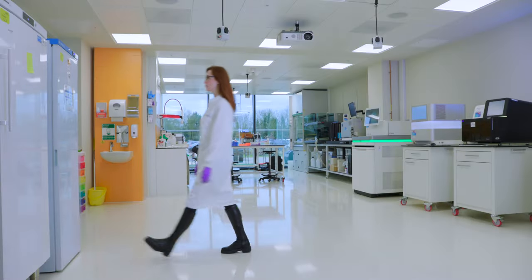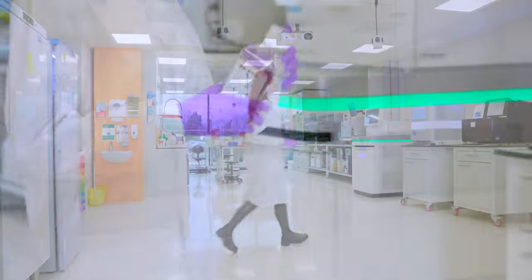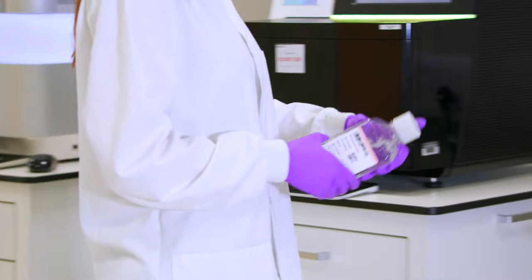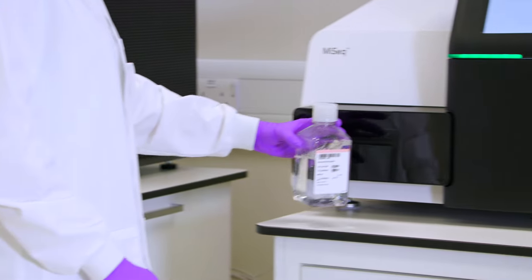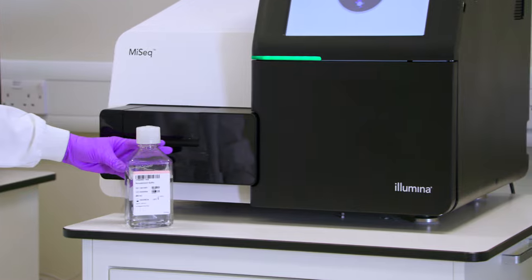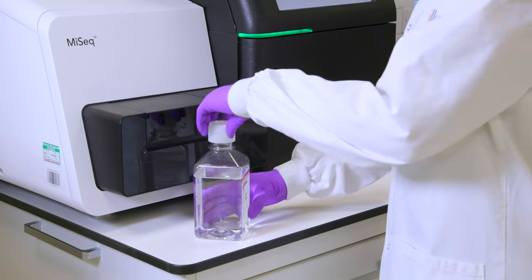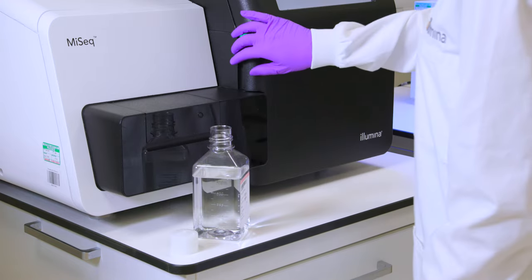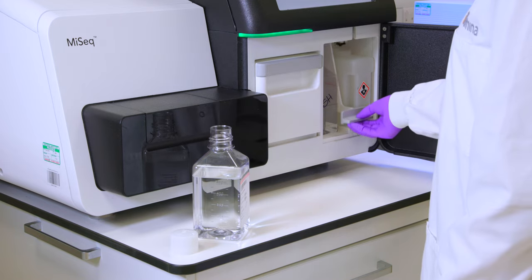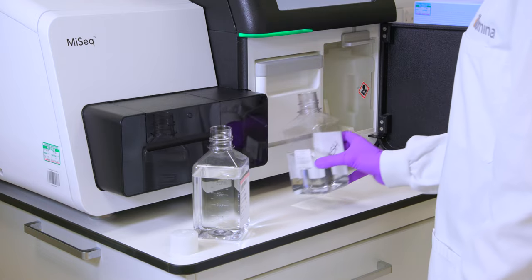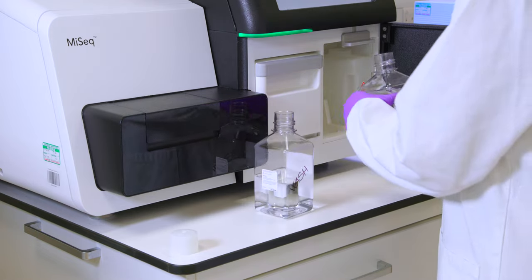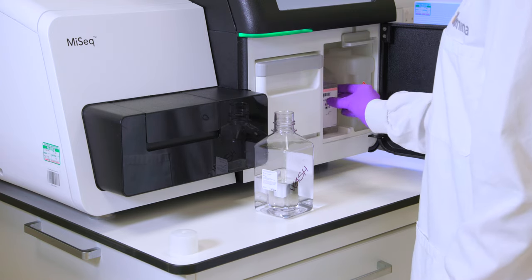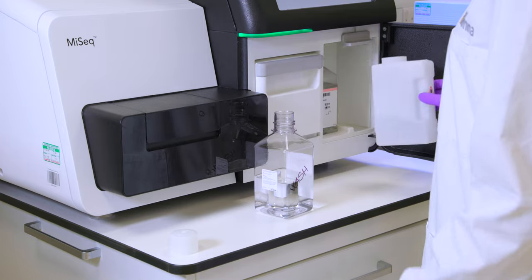Remove the PR2 bottle from 2 to 8 degrees Celsius storage. Invert to mix. Open the reagent compartment door. Raise the zipper handle until it locks into place. Remove the wash bottle and load the PR2 bottle. Remove the waste bottle and empty the contents into the appropriate waste container.